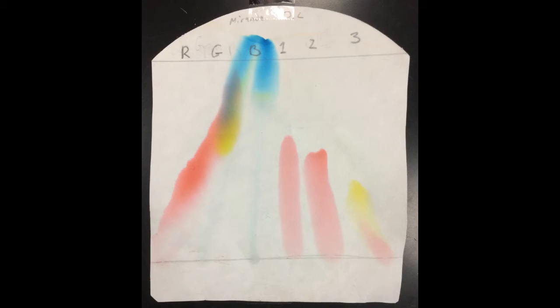The reason why water molecules exhibit capillary action is because the adhesion to the wall is stronger than cohesive forces between the water molecules. This happens because the space between cellulose molecules is small enough that surface tension and adhesion push the water up through the paper. As the water moves, it can carry mixtures with it.